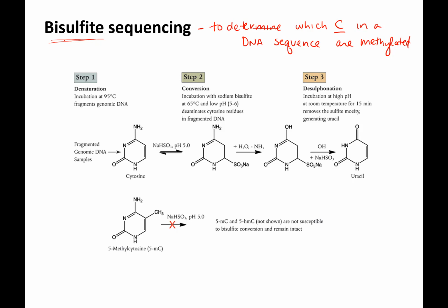a compound that will eventually deaminate. So here's our cytosine. It will remove this amine group. It's replaced with an oxygen. You have a hydrogen here, and the double bonds are moved. But the result of this chemical treatment is a nucleotide that looks like uracil.